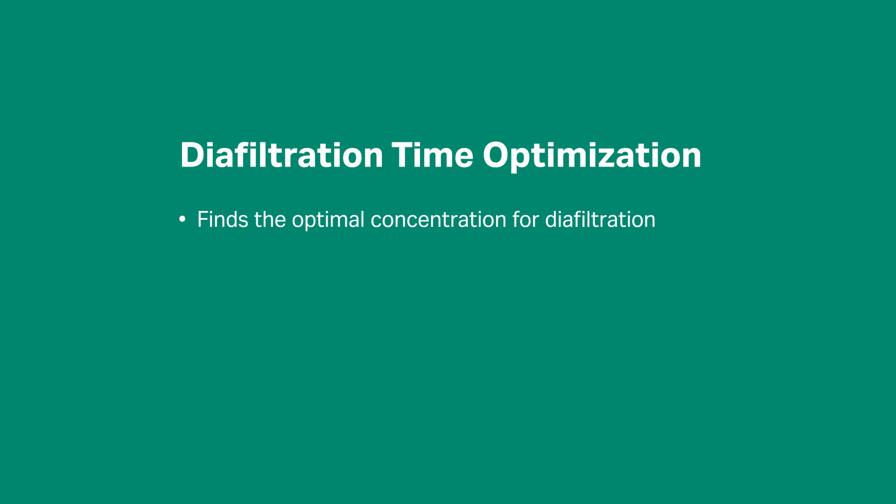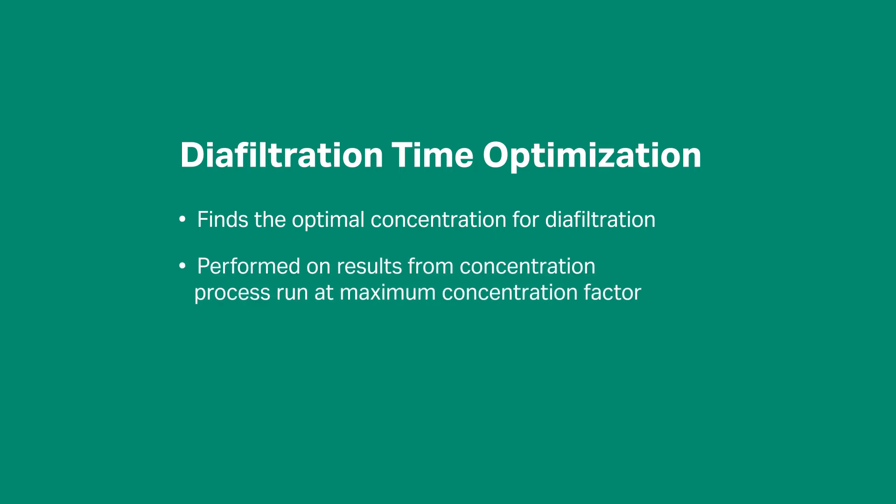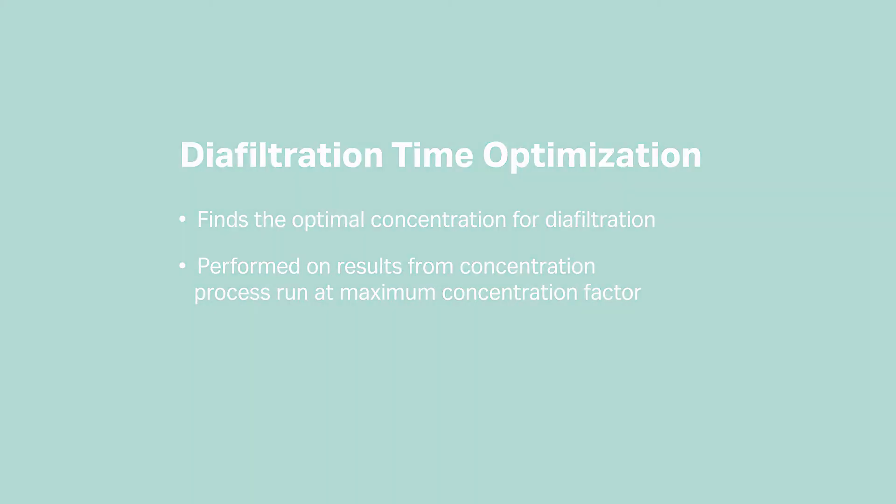This evaluation protocol is performed on results from a concentration process run at maximum concentration factor. Let's demonstrate with an example.